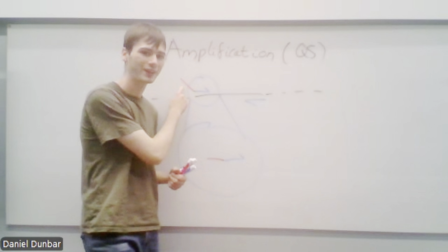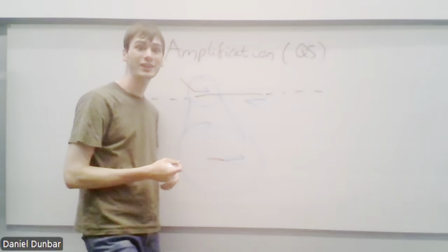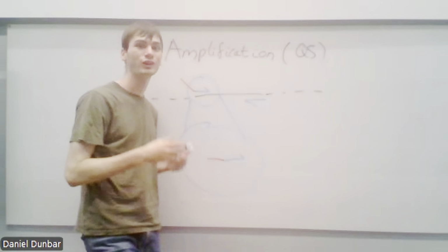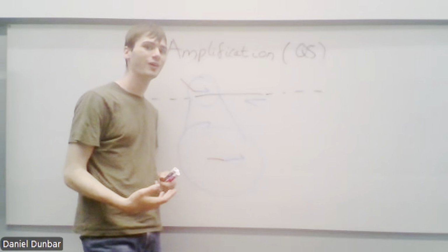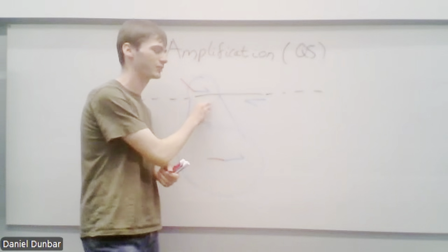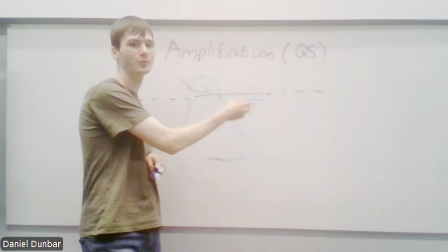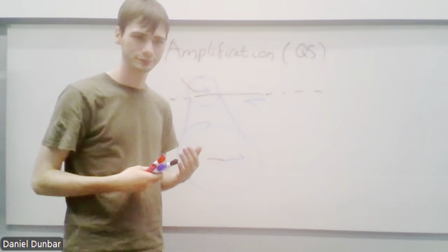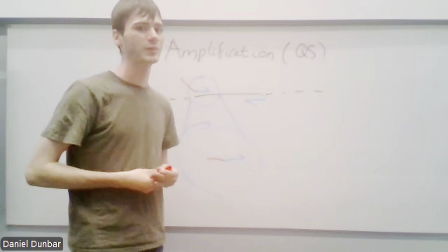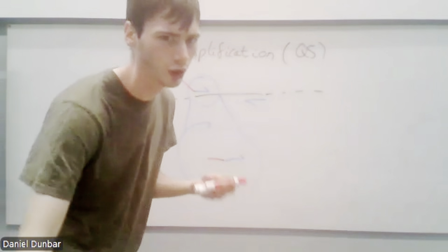And the reason you keep that tail and not the tail of the genomic DNA specifically is just because your primers are really high concentration and all the new DNA is made from the primer. And next to no DNA is made from the template strand. So the DNA that's made from the primer has to include all the primer bits. When I say made from the primer, I mean extended from the primer. So that should hopefully make sense.